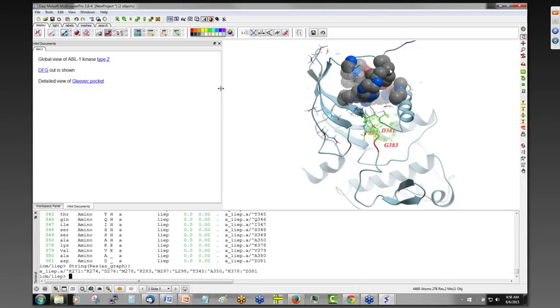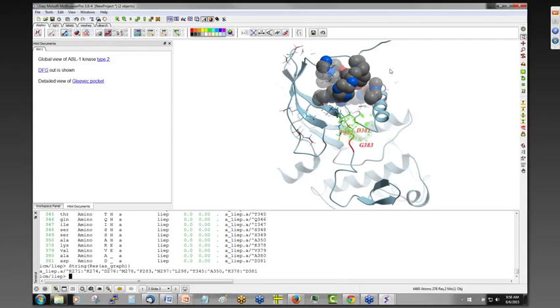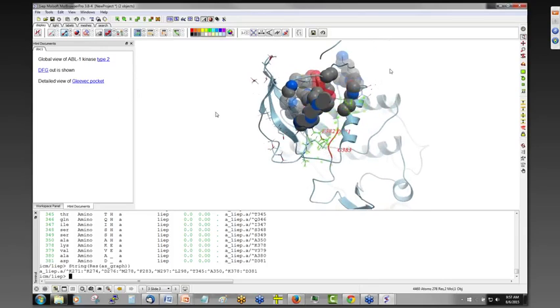Yes, everything. The tools menu. Some of these options only become active in the Pro version. For example, as I mentioned, the X-ray crystallography, 3D prediction. So basically, everything I showed, you should be able to do apart from the movies, unless you have ICM Browser Pro, which is an addition to that.